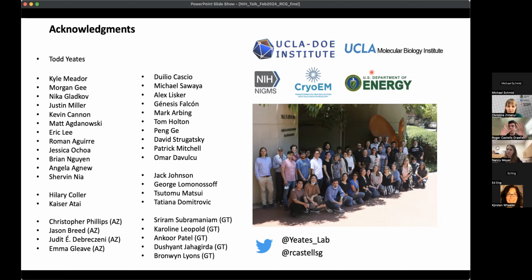And then here, we do steps like, for example, 3D classification without alignments, in case there is a binding site that is not occupied, or maybe disrupted by interacting with the air-water interface. And then we clean this data set to keep the best ones. And then we also apply some fine local refinements to try to resolve the remaining flexibility. But yeah, basically it would be this.